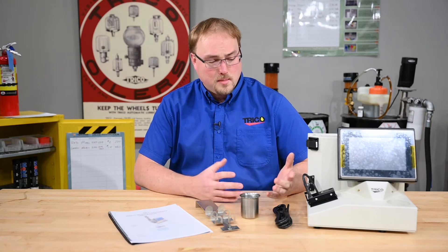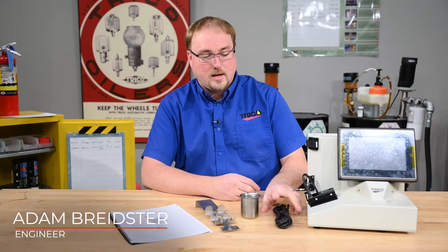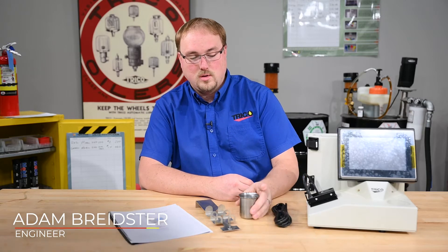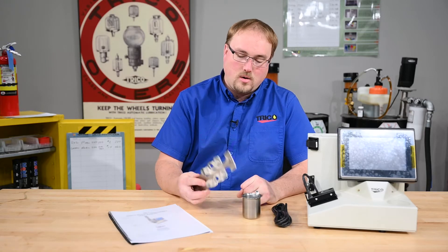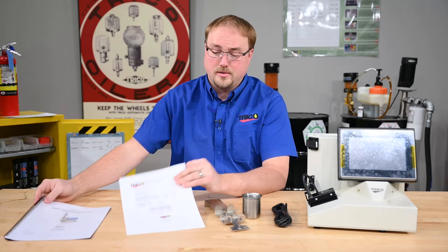We unboxed the DR7. You can see it's the unit itself, then it comes with the power cord, the waste beaker, the vial holder, the user manual, and the calibration sheet from the factory.